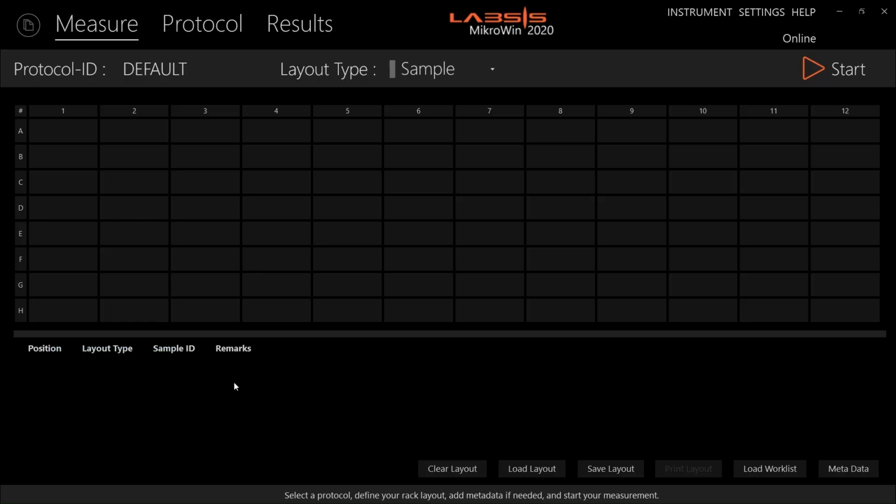The context menu offers three options for editing. Through the Insert Column menu item, we can add a new metadata column to the right of the currently selected column. The Remove Column menu item allows us to delete the currently selected metadata column from the configuration. Finally, the Customize Column menu item opens a dialog window where we can configure detailed settings for the respective column.